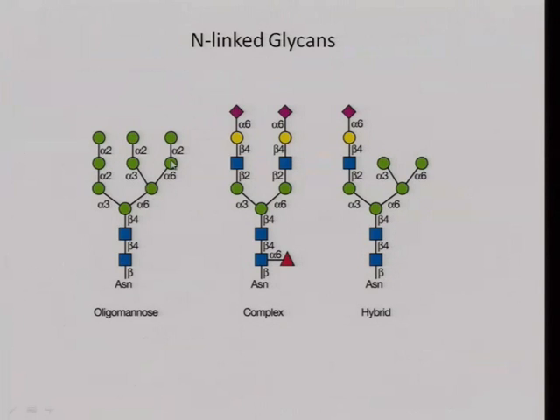So it's going to have 5 hexoses. We don't have information about the linkage here, so I can't tell you whether it's 2 on here and none of these 4 there, or whether it's 1, 2 here, or any other combination. We've just got a composition.